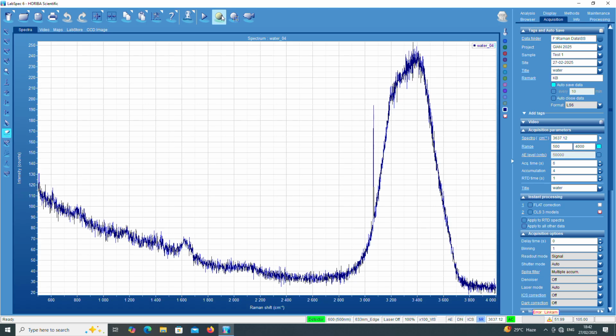So yesterday, do you remember the black spectrum is a water spectrum. Then the OH stretching of H2O is here, the HOH bending is here, and its intensity is about one third. So this is a large peak. In the case of the Raman spectrum, this is strong, but the HOH bending is quite weak.